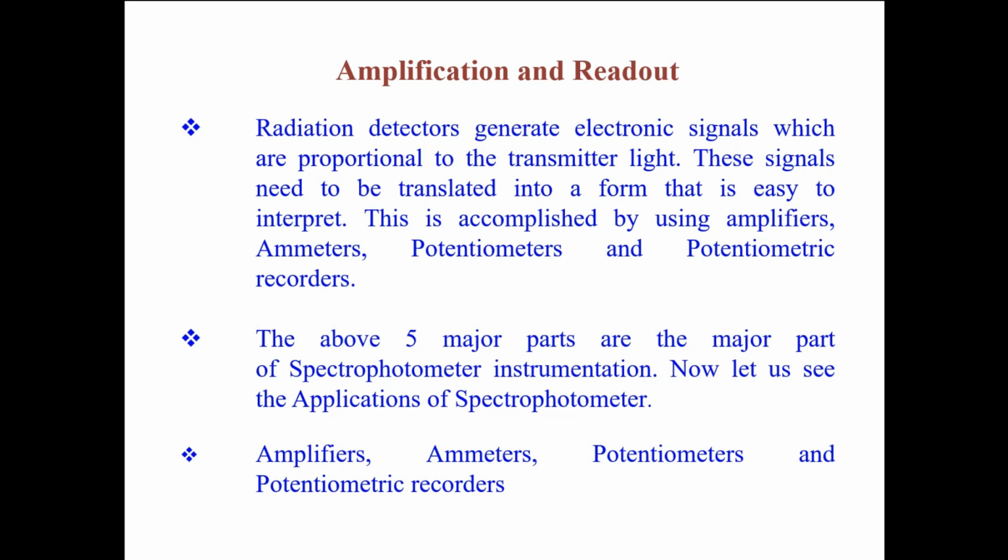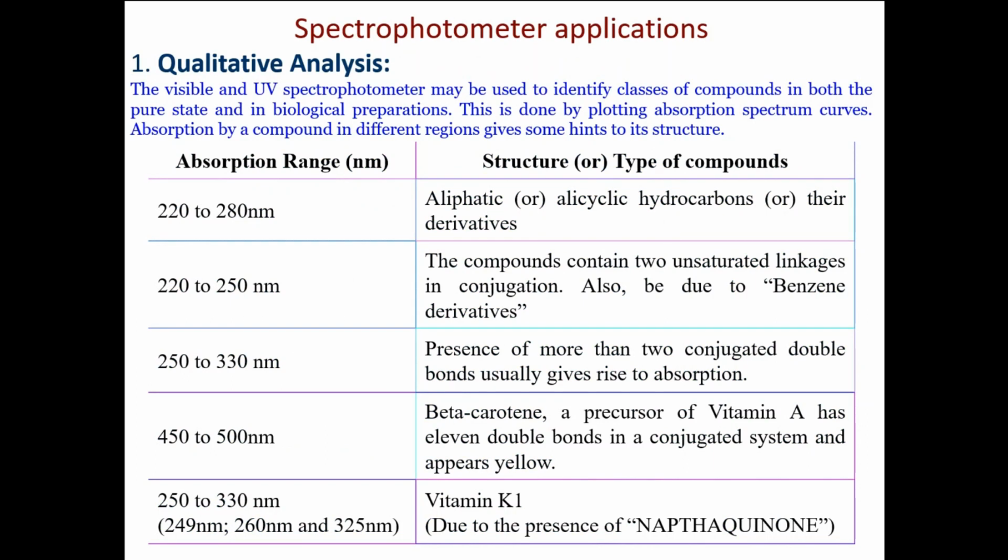Okay, so the amplification and readout devices we already saw, right? Okay, so the next one is applications of the UV visible spectrophotometer.